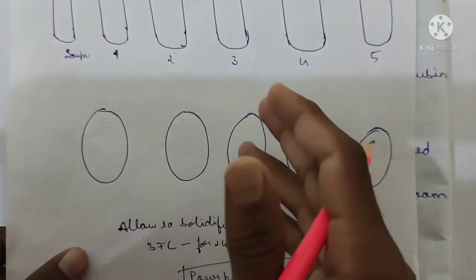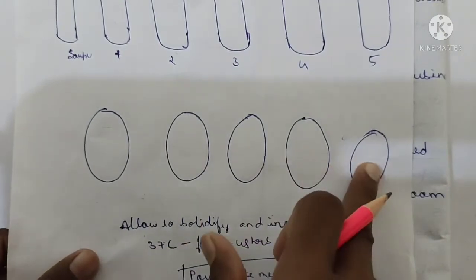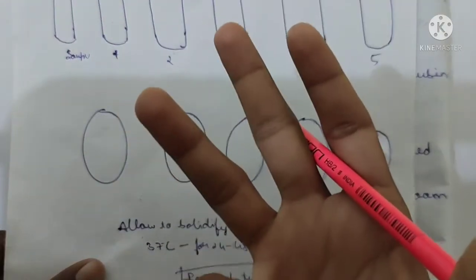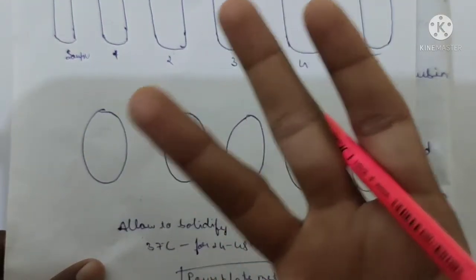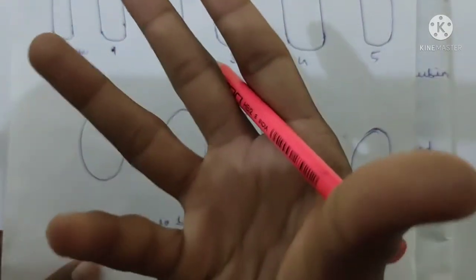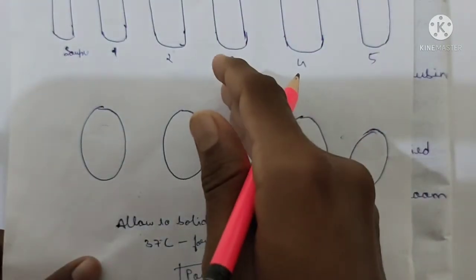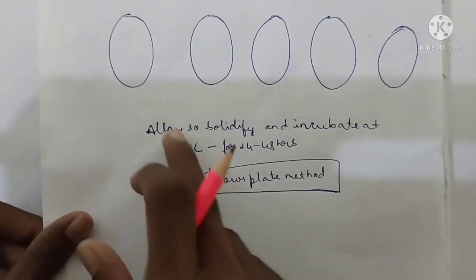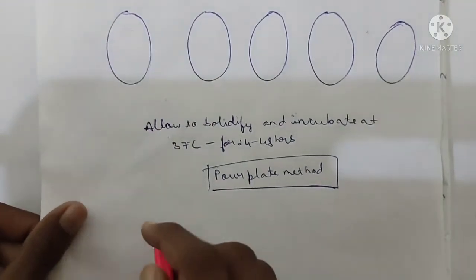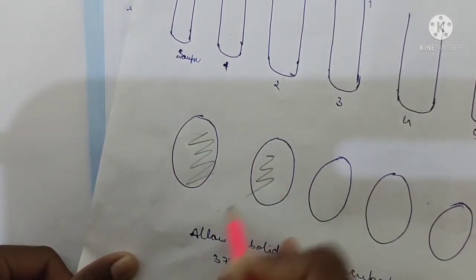After incubating for 24 to 48 hours, okay, in all these petri dishes, at a certain time we will get some pure culture organisms. Okay, to get some more extra pure microorganisms, what we have to do is transfer or strike on that petri dish.